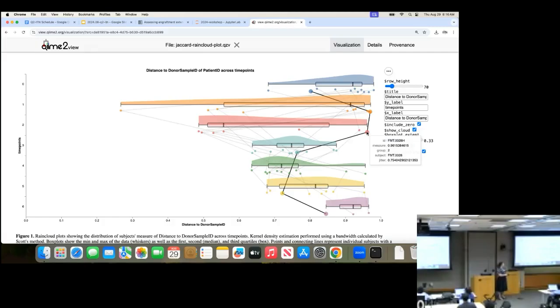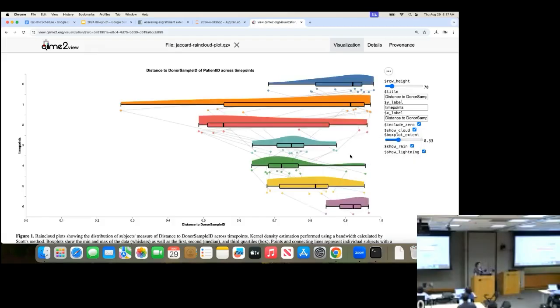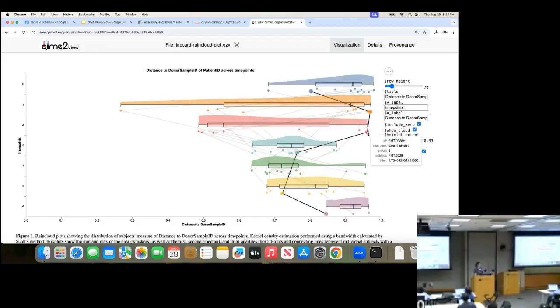Yeah, so we have statistics that tell us a little bit about it. You're totally right that at time point 3 is when we see the biggest change over time. Now, that isn't that surprising. That's the moment when they had the biggest intervention, right?